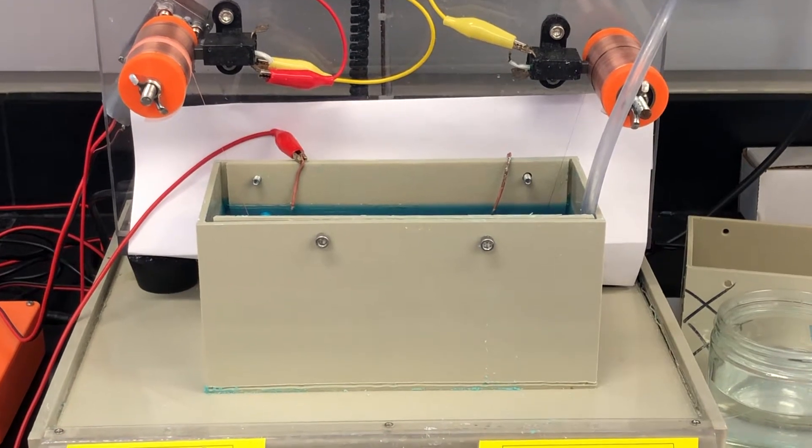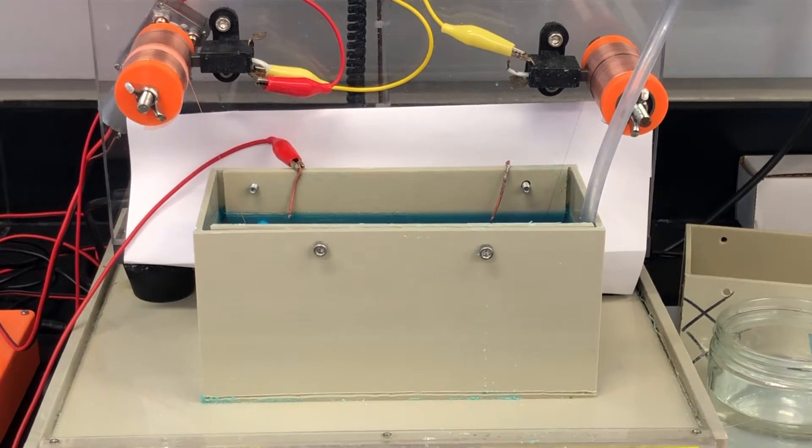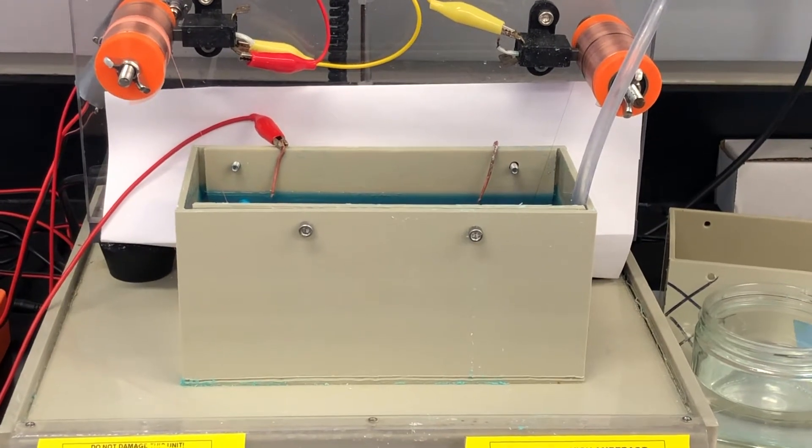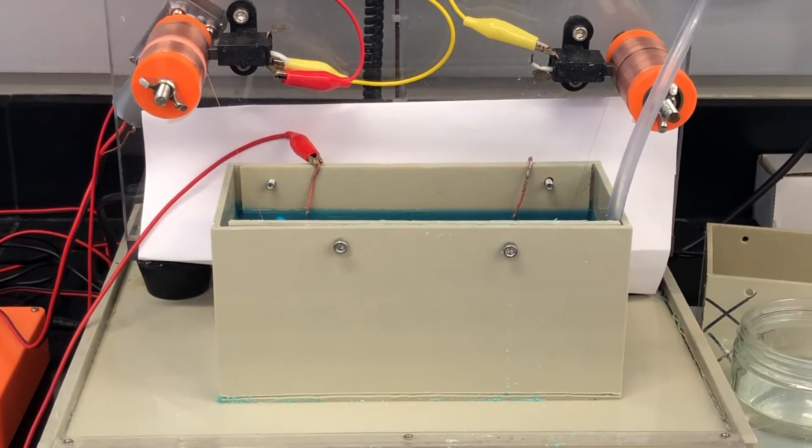So here we have an apparatus that allows us to continuously plate a long length of carbon nanotube yarn with copper through an electroplating process.